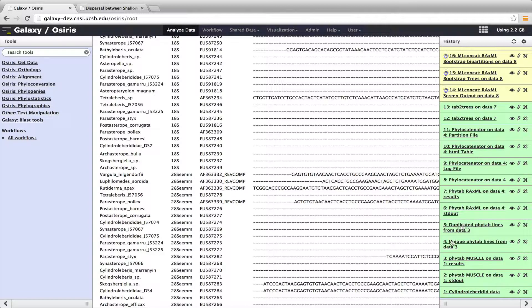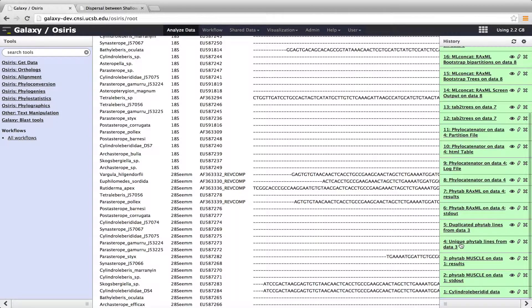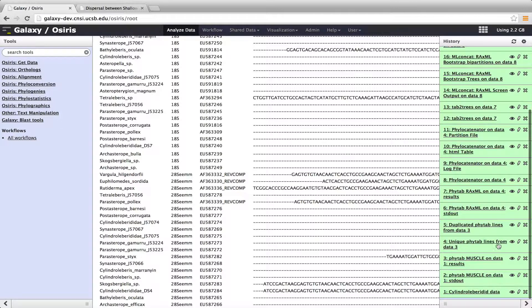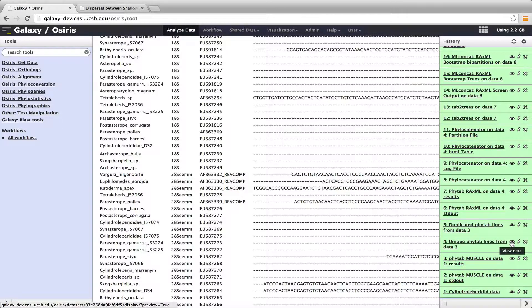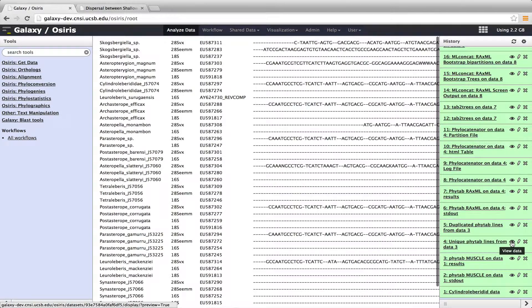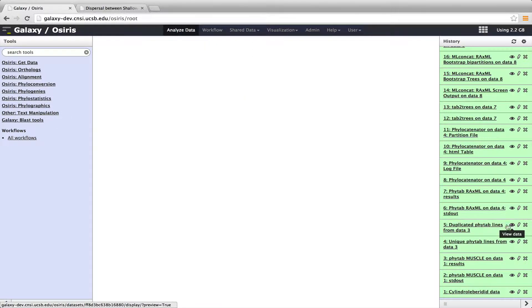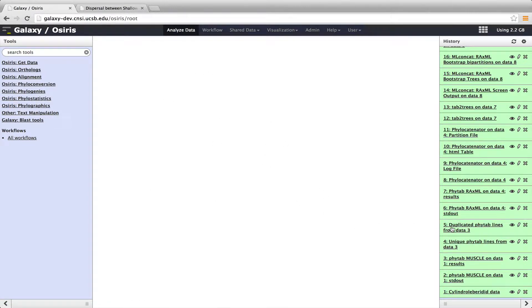So MUSCLE then aligns it. As I said, we then go into this tool called Remove Phytab Dupes. And that gives us unique sequences, which are shown here. It also gives us duplicated sequences. So it gives us two different files within our history. In this case, there were no duplicated sequences. So duplicated Phytab lines is empty.